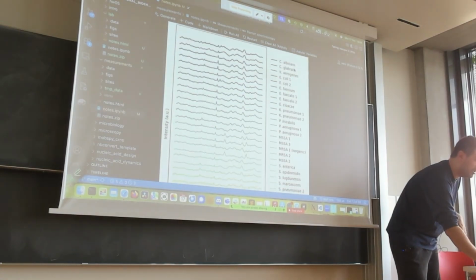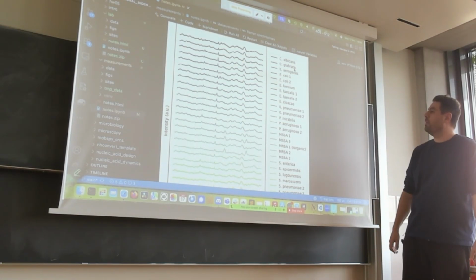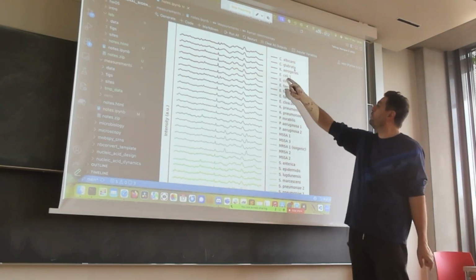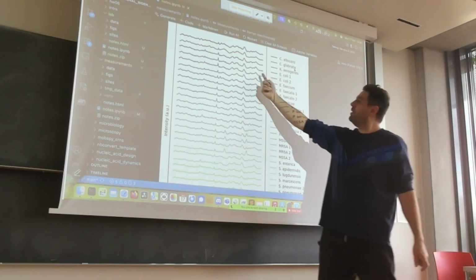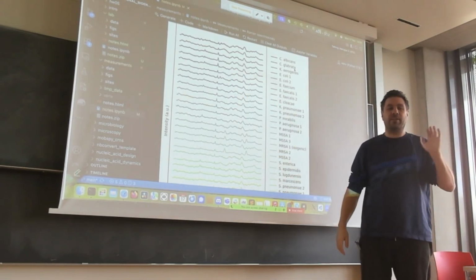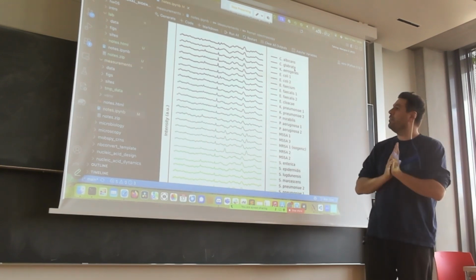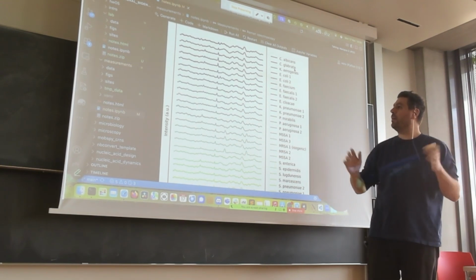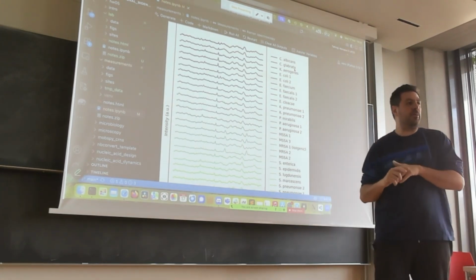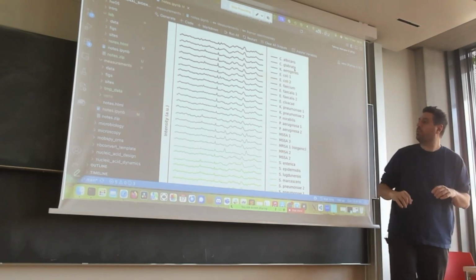And this is the library. So here we see real spectra of bacteria. For example, let's look at E. coli. There are two E. coli types. This is already a complicated spectrum. It is by far not as simple as, let's say, glucose or alcohol. It's a super complex biochemical species, E. coli, so it will have a huge complex spectrum. And this is what we see here.